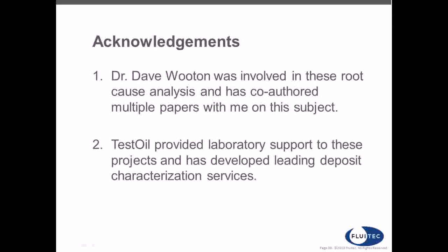Unfortunately, it is not, predominantly because it's much easier to get an oil sample than it is to get a deposit sample. It is possible to try to separate out these components, these degradation components in the oil that can be contributing to deposits. So it is possible to do some separation processes on the lubricant to analyze, but that's not often done. Ultimately, there still may not be a correlation between deposits that are actually in the oil and the deposits that are actually in your system.